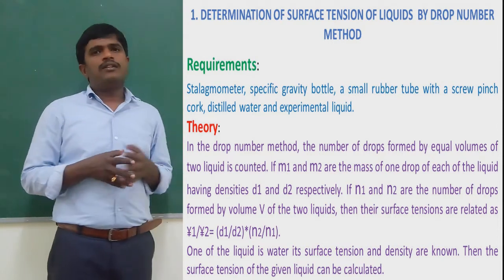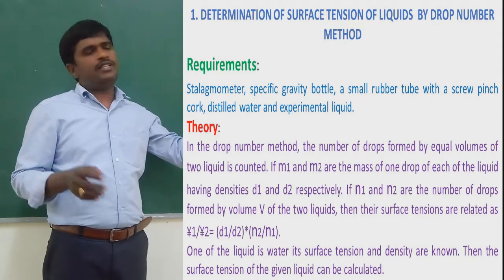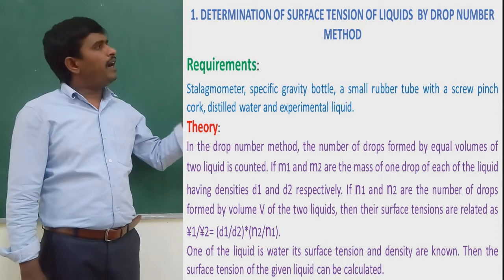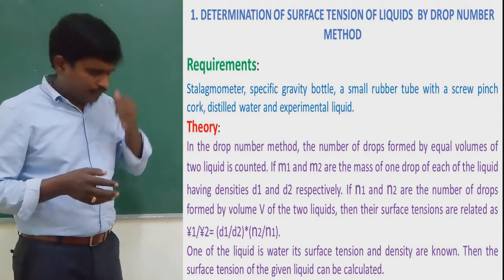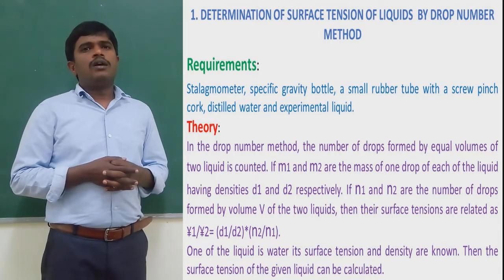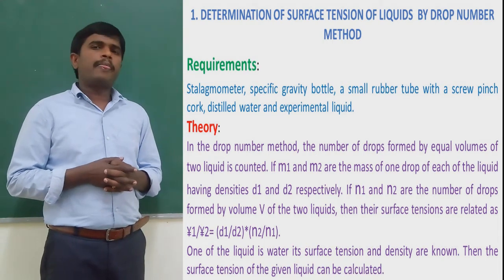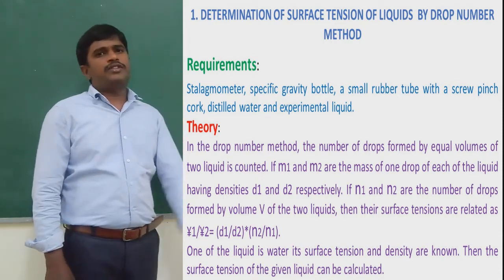In this session, we will discuss the determination of surface tension of liquids by the drop number method, and another one is by the drop weight method. Let us see the first one: determination of surface tension of liquids by the drop number method.